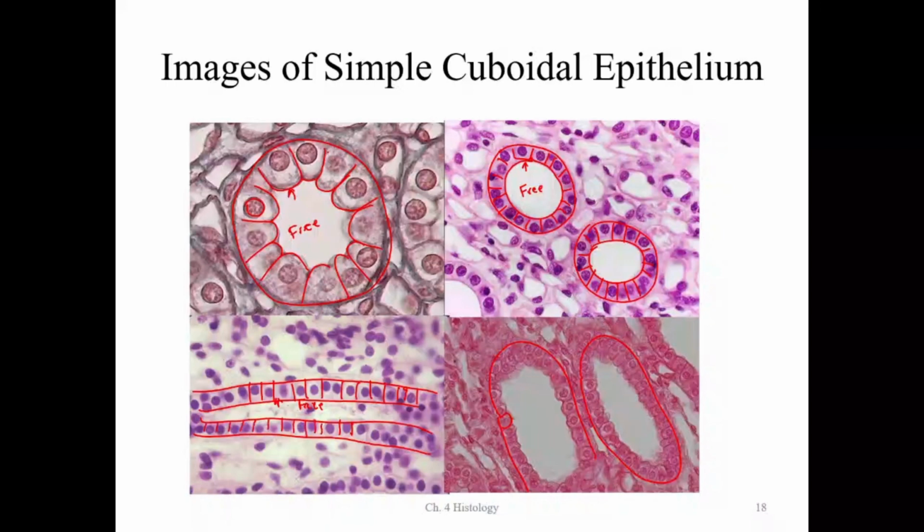They're forming tubes. So if I had a three-dimensional tube and I looked at the end of the tube, I would see a circle. But if I took this tube and cut it this way, lengthwise, I might see something that looks like that.